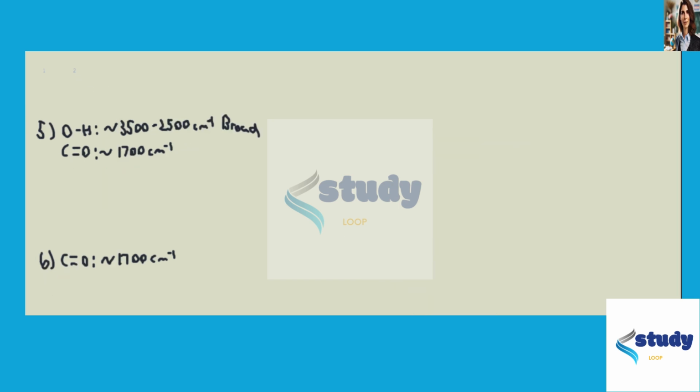Then 5 and 6 I've put here on a next page. The major features of 5 are a very broad, wide OH stretch. That right there is screaming carboxylic acid, especially taken in conjunction with the carbon-oxygen double bond at 1700. So this is definitely A, our carboxylic acid.